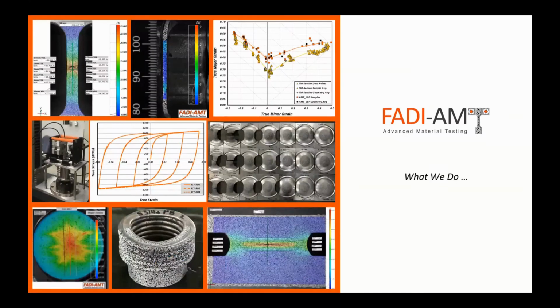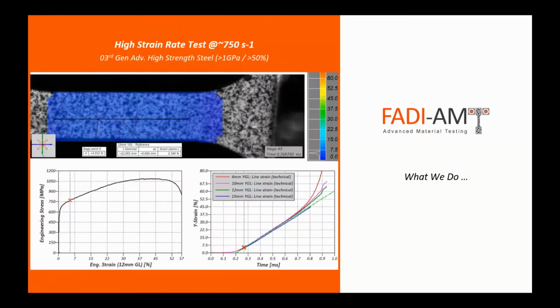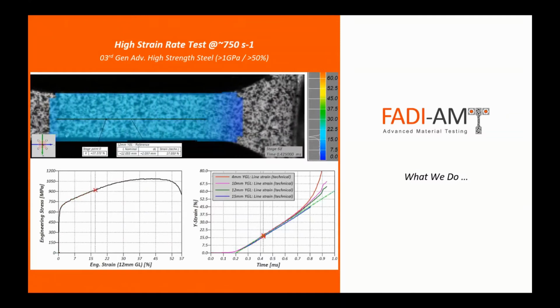I typically like to cover one aspect of the tests that we perform because we do a wide variety of tests, as you can see on the screen, between tension, compression, formability, fracture, and even some component testing, as you can see here. So to do that in a nice way, I usually pick a video to play and demonstrate one of those items that we focus on.